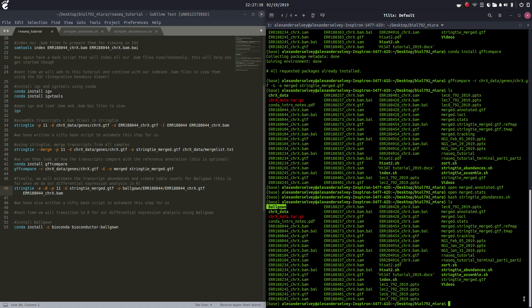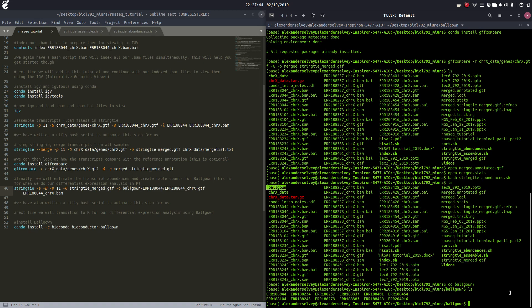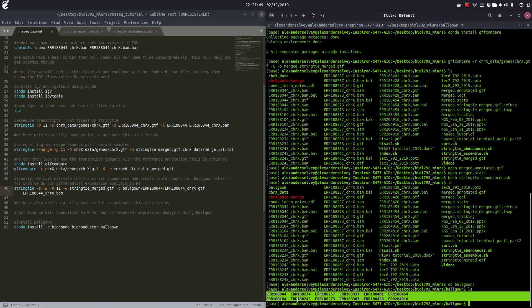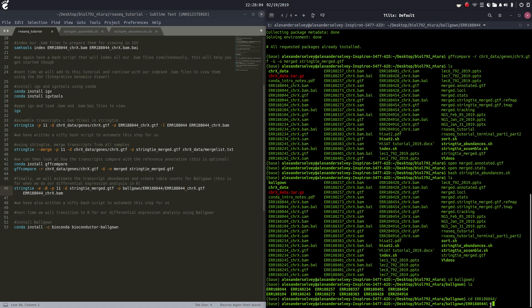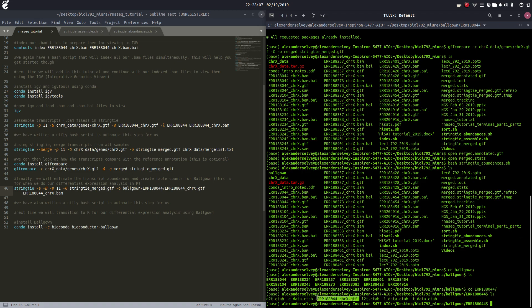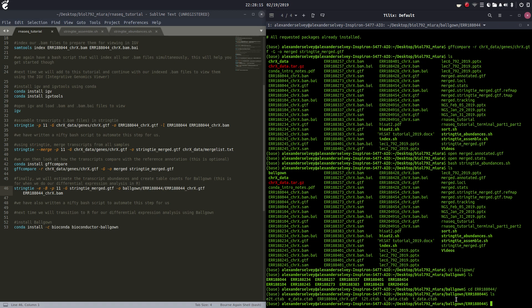We're done. We've created our ballgown directory. Let's open that up. Here are all of our sample names created into their own directories. Let's switch into the first one - sample 188044 - and show you that here's our output GTF with all of our table files that we will use in Ballgown, which will be done in R, not from the command line.